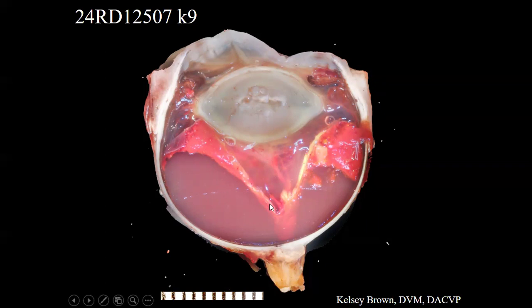So here's that gel. We have our detached retina here. Just for those watching at home, when we say gel, this is semi-solid. It's hard to convey that, but imagine if you're trying to cut it, it will probably not pierce the surface almost sometimes. Very weird jello. Yeah, very dense jello. You can see the knife changed directions in it, like right here. Yeah, exactly. That's an excellent point. A helpful artifact.